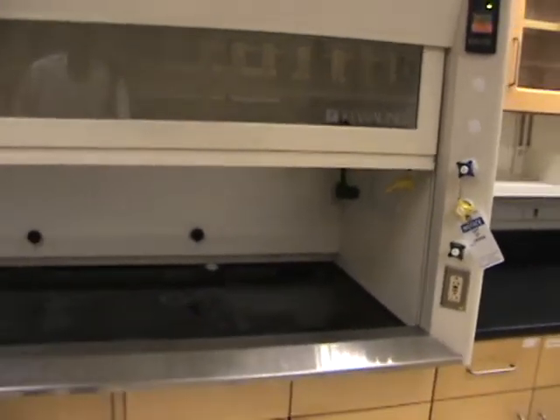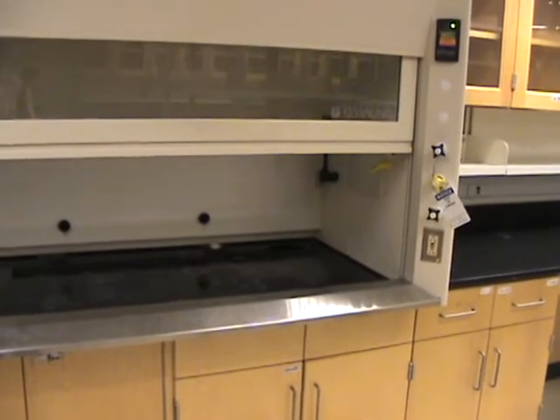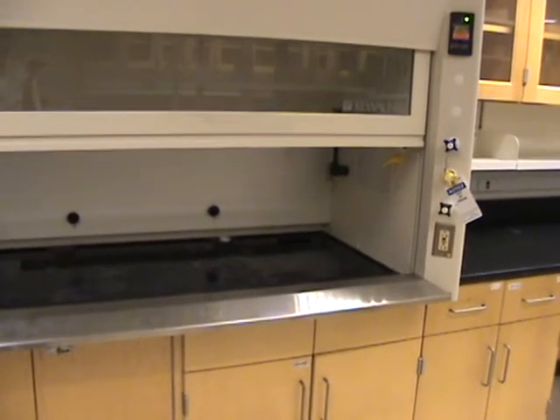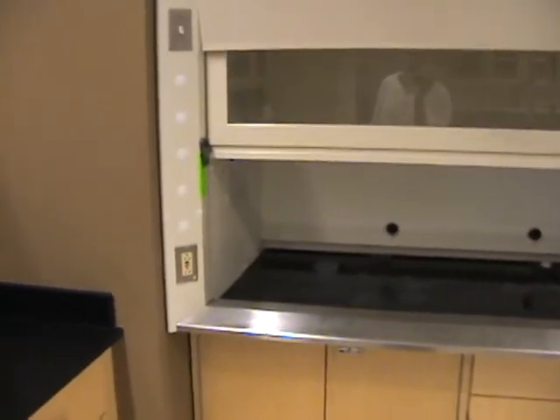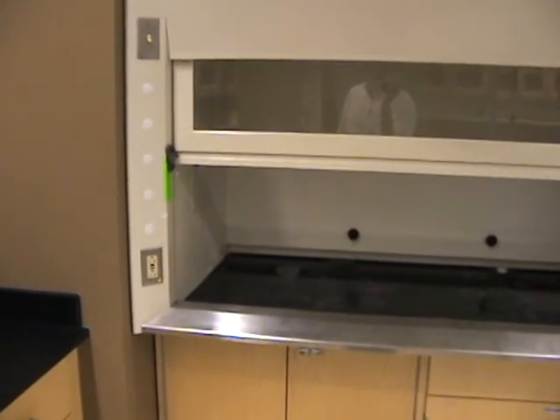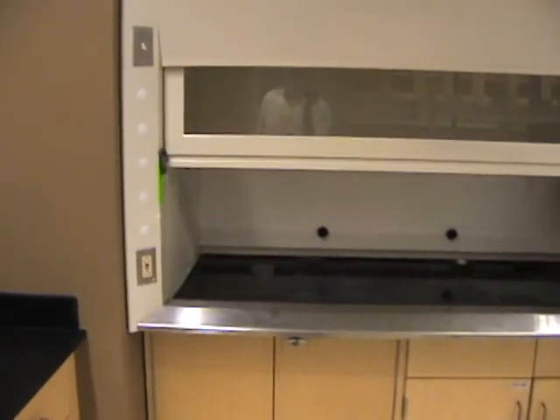Each hood has a sash window which is normally set at a predetermined height. The hoods have to be calibrated at least once a year. The face velocity of the fume hood must be calibrated to be within a certain minimum range and not over a certain maximum amount.